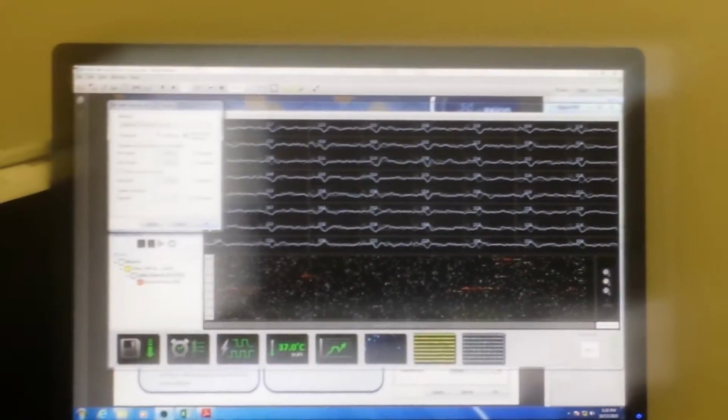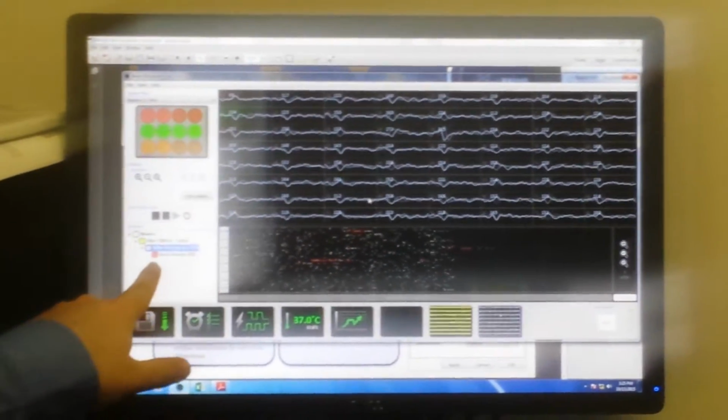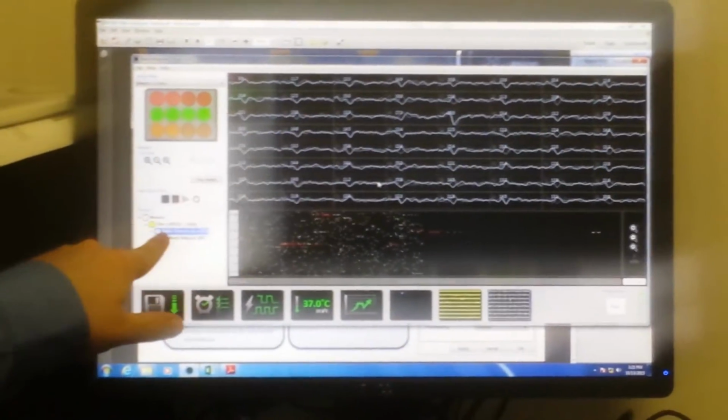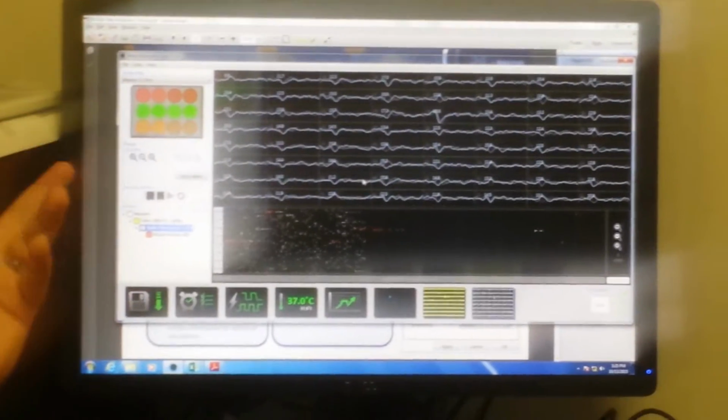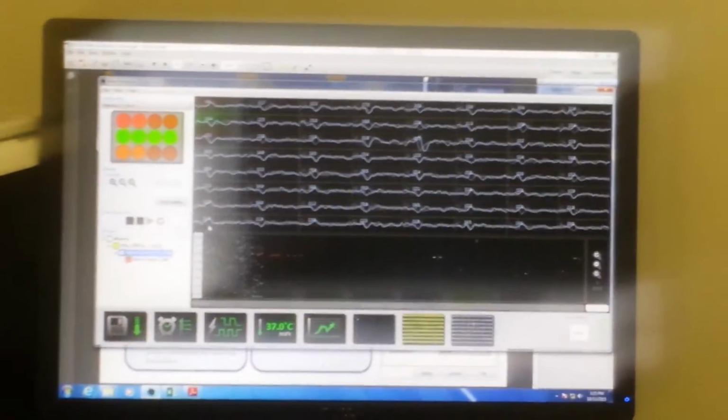So now those are like false positives, right? Exactly, yeah. What's the red versus the yellow? Down here? Yeah. So the white is every event. The red is our burst detector. So these light blue come from this light blue, this red comes from here. So if I change the color down here, it's going to change the color on here.